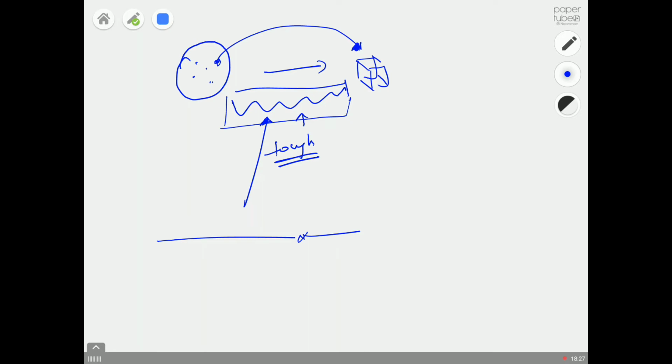What the laboratory experiment is about, like what are the experimental conditions I fixed, what data I'm going to supply, how you have to look at the data, how you have to process your data, and how the report should look. So that will be a half-an-hour video.